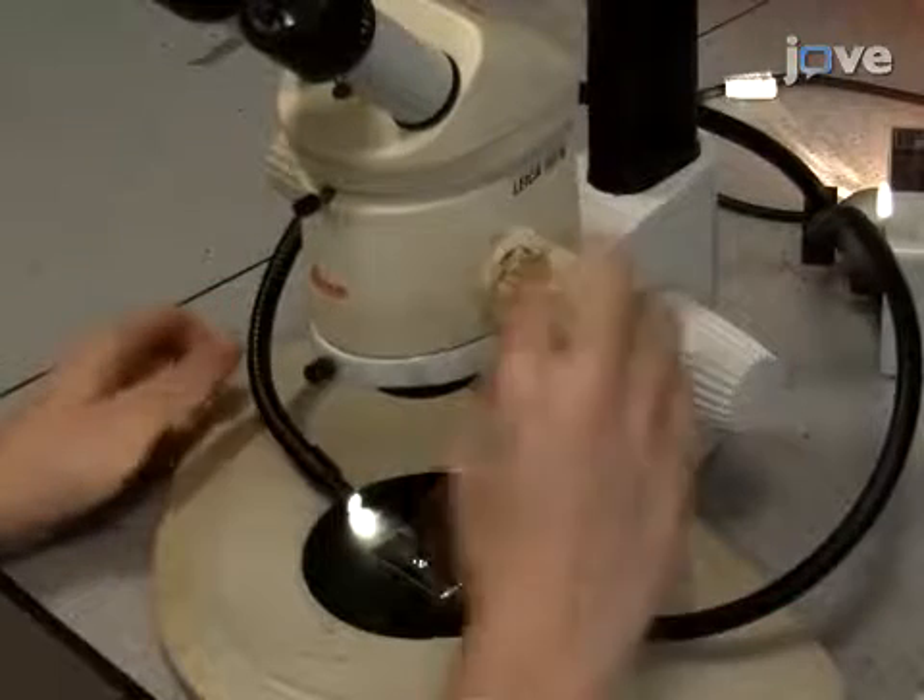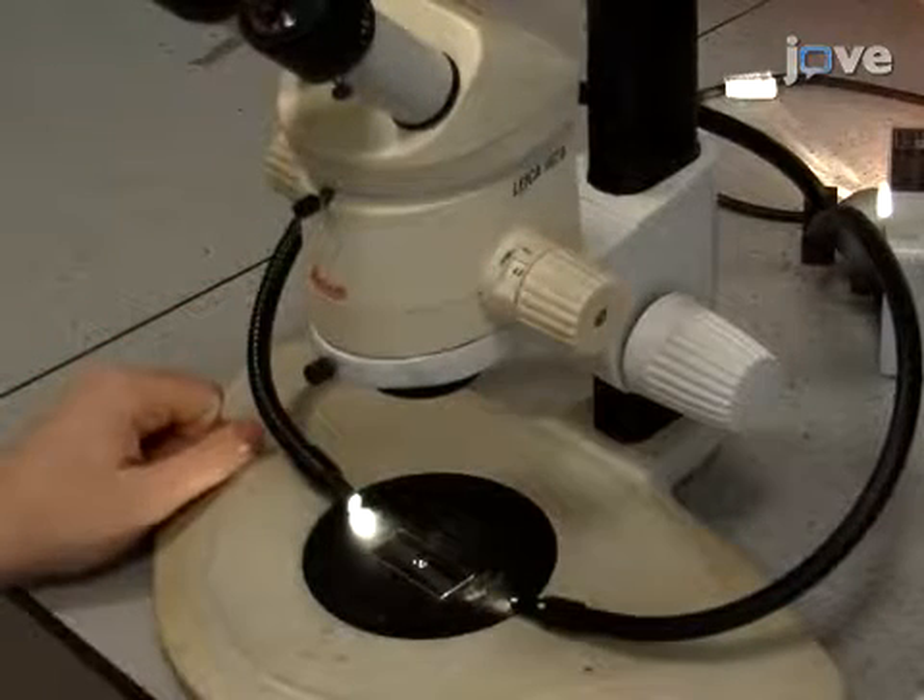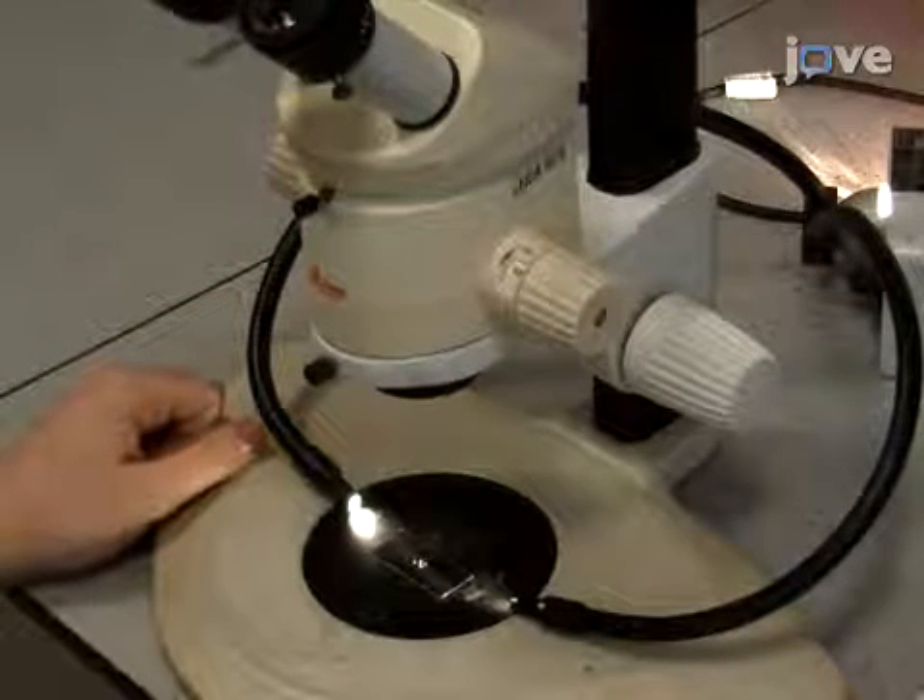To begin this procedure, set the magnification of the dissecting microscope to 4X. On the first cover slip, separate the two ovaries by tearing the oviduct with a pair of closed forceps and a dissecting probe, taking care not to puncture any egg chambers.